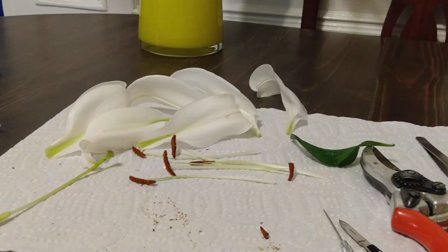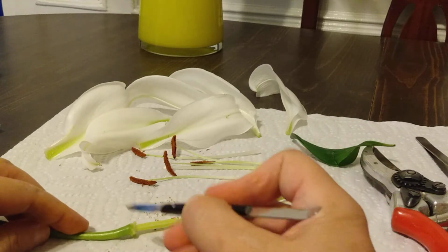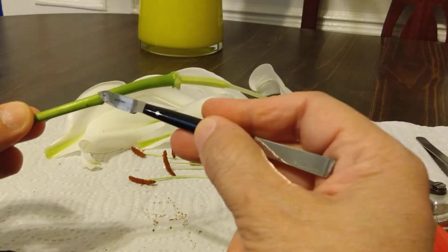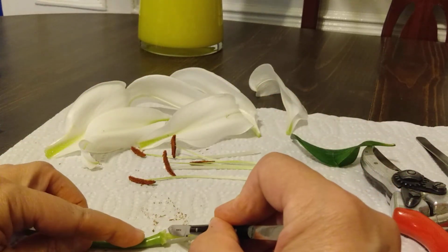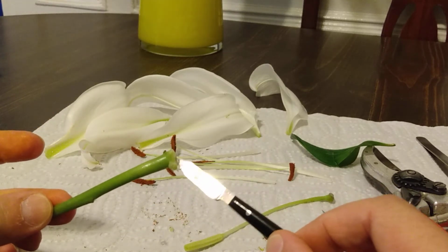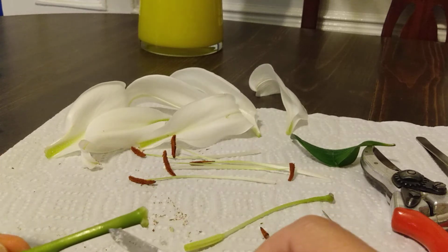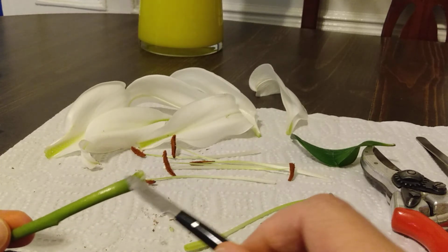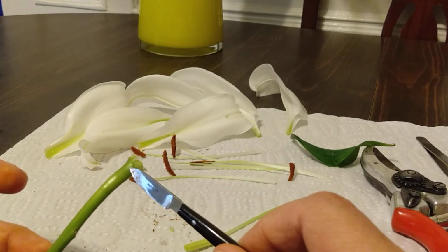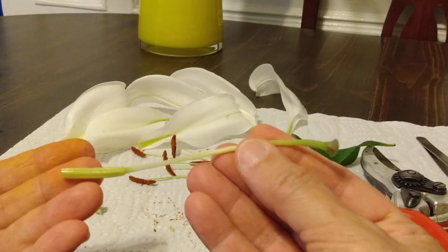And now if we look at the female organ, now I'm going to remove it from the stem. So here's the stem that the flower was attached to. I'm going to remove it from here. And the point where the carpel is attached to the stem is called the receptacle. It's basically just the tip of the stem that holds up the flower. So this area is called the receptacle. And then I removed the carpel. There's just one in this one.